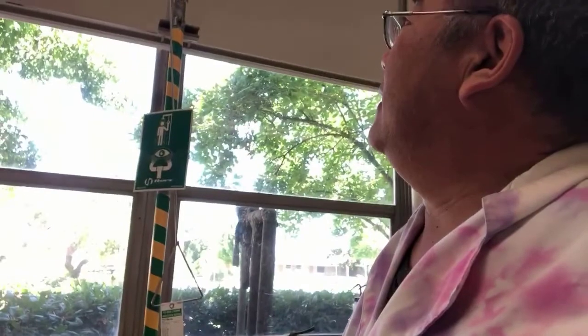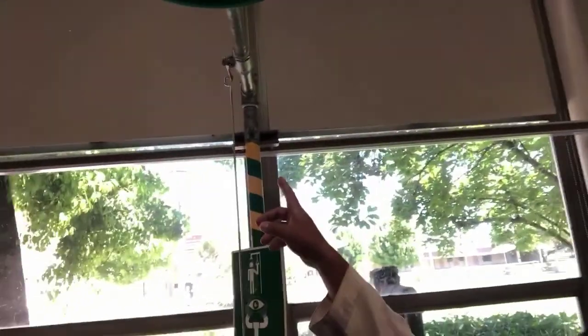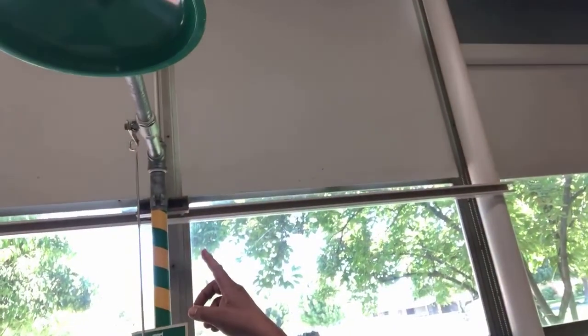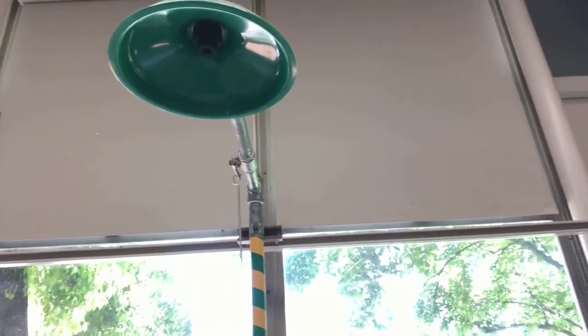We also have a shower, in case there's a chemical spill. Somebody drops a bottle, this is the most common way this happens, it shatters and liquid goes all over, right? At times, the best thing to do is just to wash it off. I won't demonstrate this because it's quite a mess. You grab this and you pull it. That activates the shower on that lever. You can see it right there. And then that'll bring a lot of water out of that. Again, there's nowhere for it to drain, so the floor becomes quite slippery when that happens.